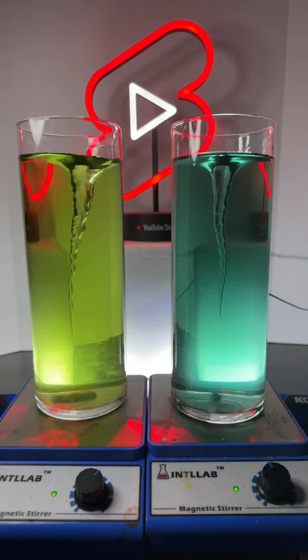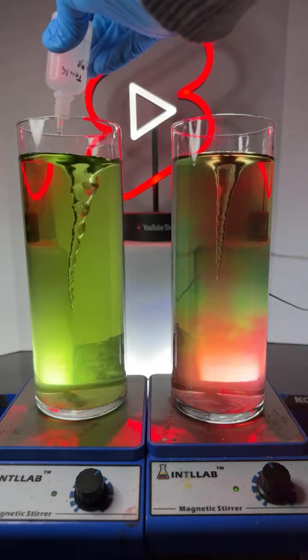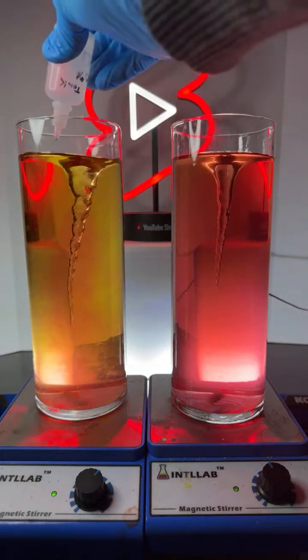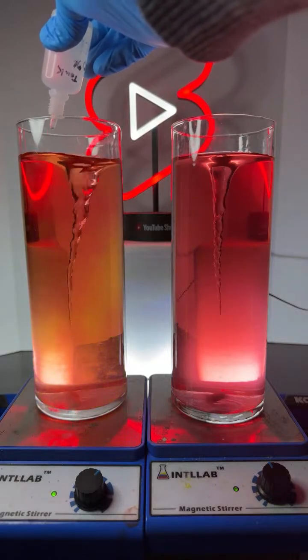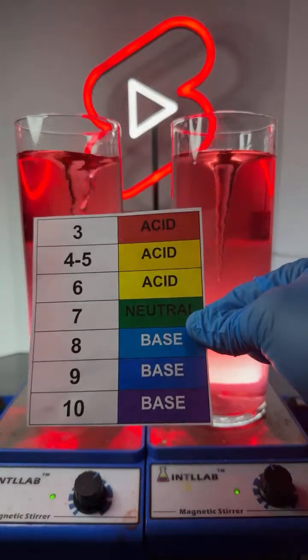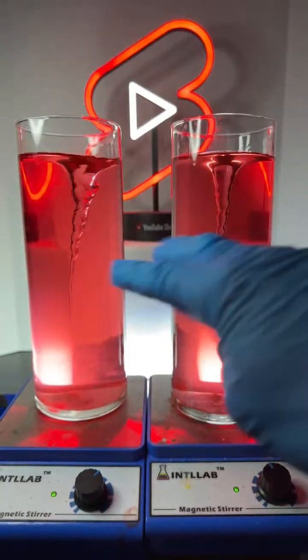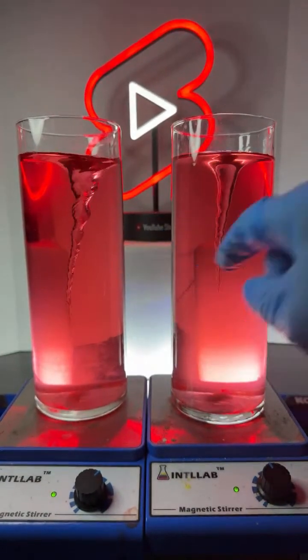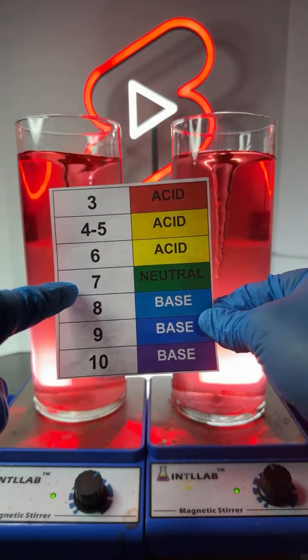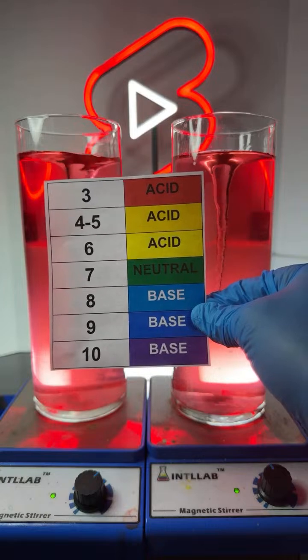So yeah, we're just doing some experiments here. I'm adding acid to both flasks right now. The acid I'm adding is hydrochloric acid. It's the same acid that's found in your stomach. It's just that what I'm adding is like 100 to 1,000 times more concentrated than what's in your stomach. And of course, you see that color shift to red, and that red color tells us that we've got an acid. And the way the pH scale works, if you're 7, you're neutral. This indicator system will be green at neutral. And the further away you get from 7, the less neutral you are. So the further you go below 7, the more acidic you are. The further you go above 7, the more basic you are.